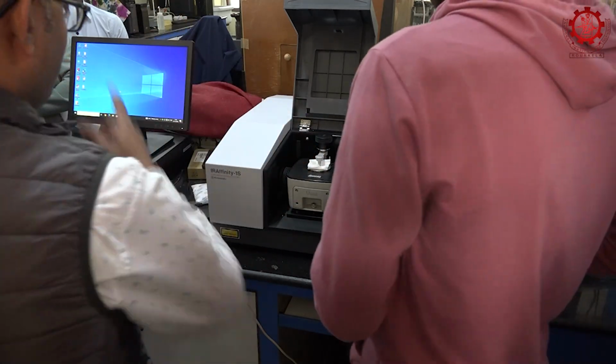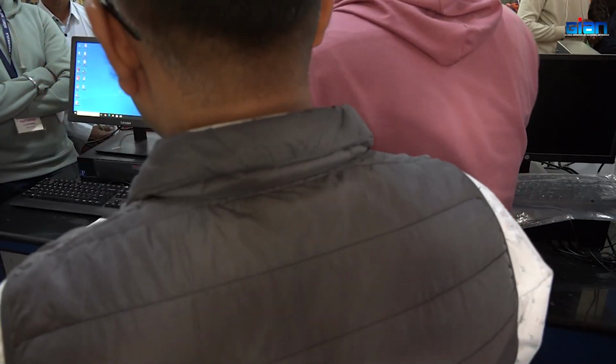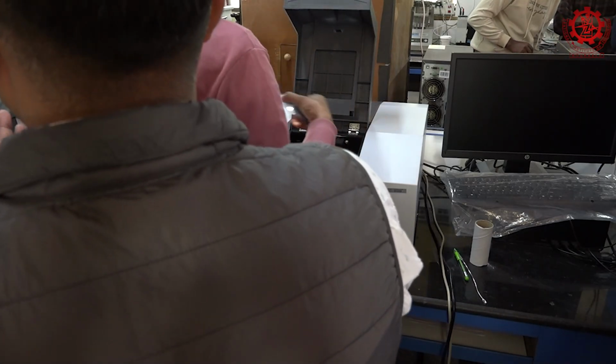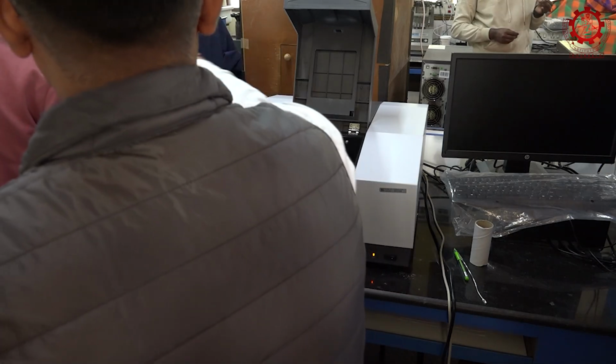Please carry on, and then we will talk more theory. So now you can see here, it's very difficult. He is trying to put the sample in the place in the spectrometer where we will put our sample. After putting our sample, the infrared will go and interact with the molecule, and then we will get the spectrum there.